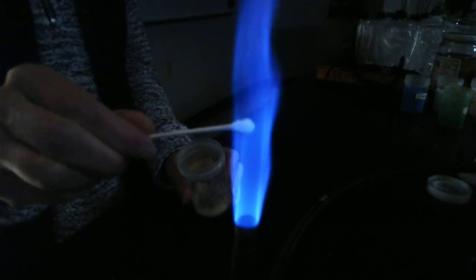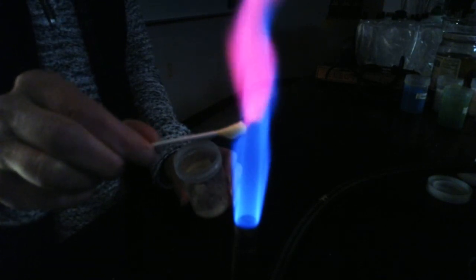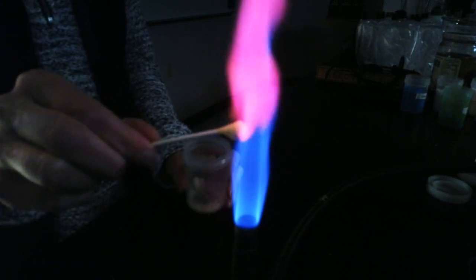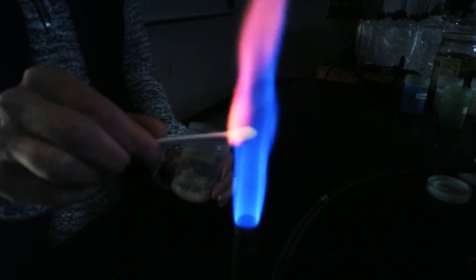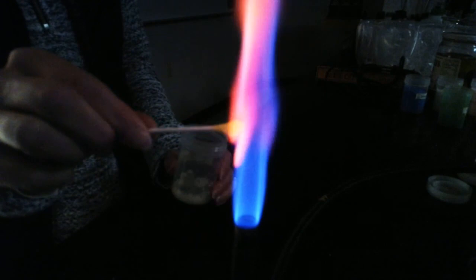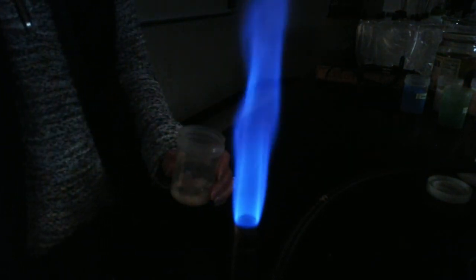Same kind of thing. Usually I get a good test with this one. We tested strontium chloride. Oh. Every now and then, can you see this red, kind of a crimson red in there? Well, this is strontium nitrate. It's the same metal. They're both having strontium in them, and so you get the same observation. Cool, cool, cool. Okay, so I'm going to turn the burner off for a second.